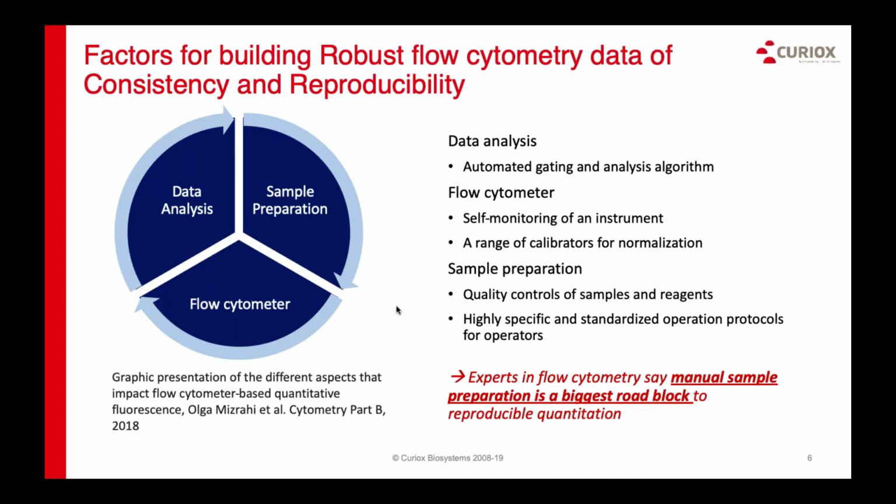The most challenging component is sample prep. In this particular review paper, authors claim that we have to apply much more effort for our operators to strictly follow SOPs, which I'm sure is very rigidly adhered to in flow cytometry cross-matching labs, and also to ensure they minimize mistakes and report any deviation. Experts in the field, however, do not necessarily agree. They firmly believe pushing operators is not the best solution. We need a different solution if we want to achieve robust data of flow cytometry.